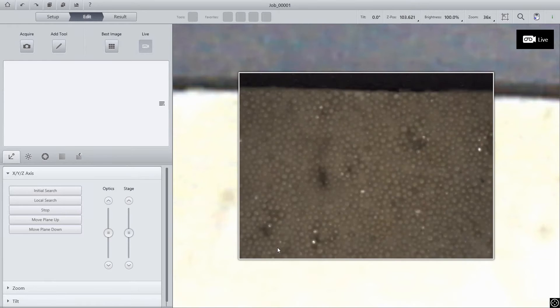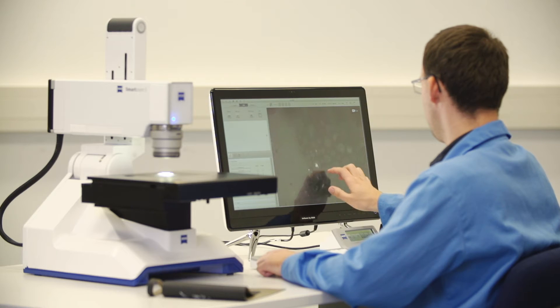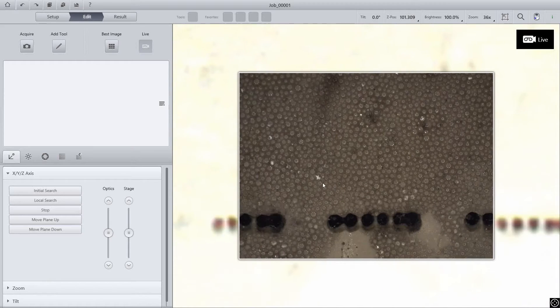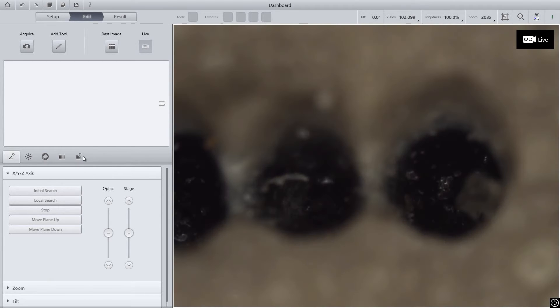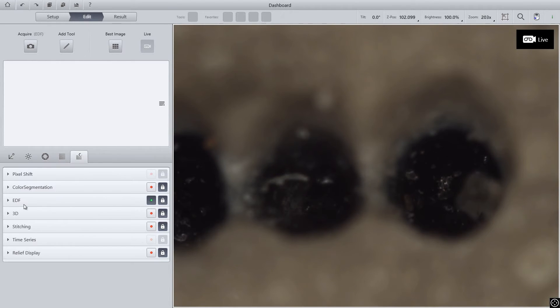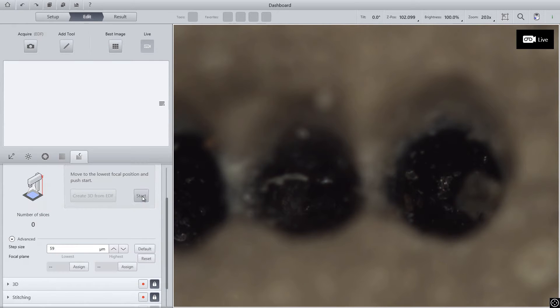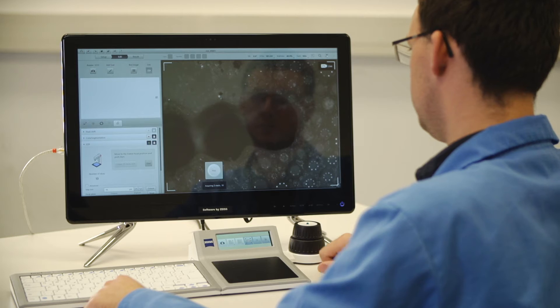Then acquire the image. Meanwhile, the system automatically records every step of the process and fully documents your work.